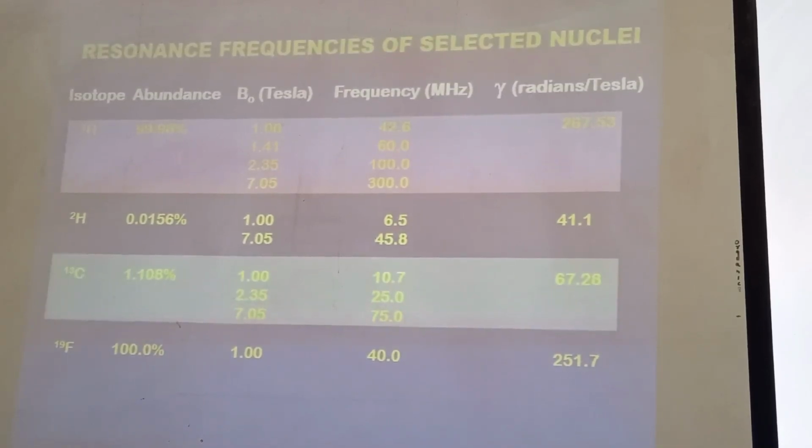So you have equal number of molecules, 100 for analyzing proton, 100 for analyzing carbon-13. Out of those hundreds, 99.9 molecules are useful for you to see proton, but only 1 of those 100 is useful for you to see carbon-13.